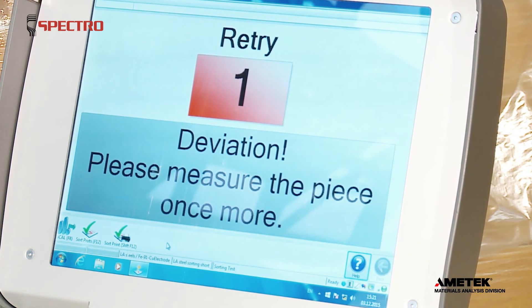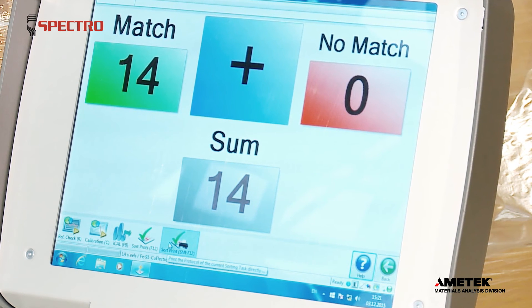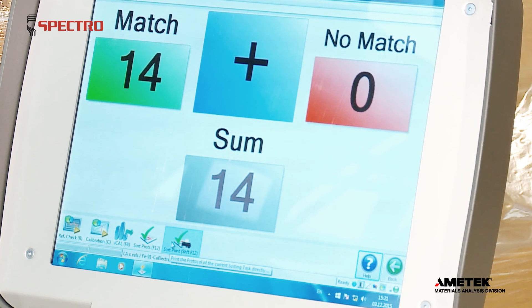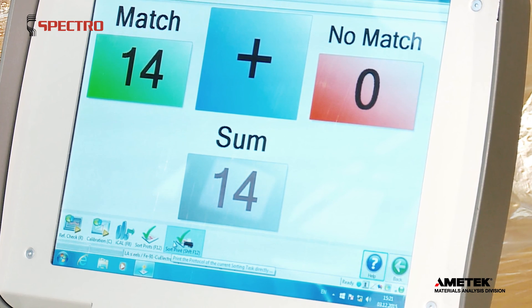If three measurements in a row miss a defined limit, the sample is rated as no match. The screen counters keep track. Sorting limits can be stored in different sets for different tasks.